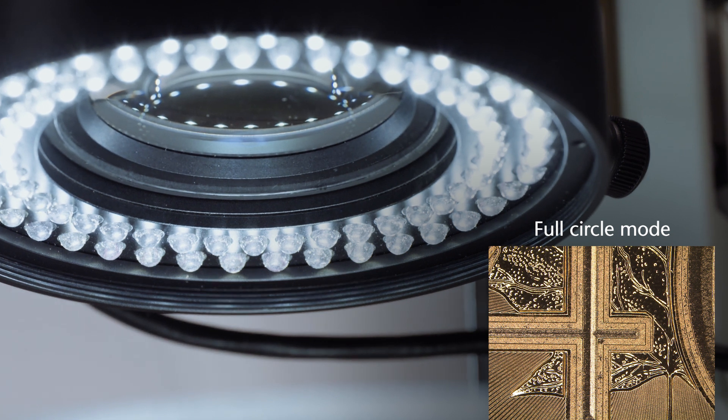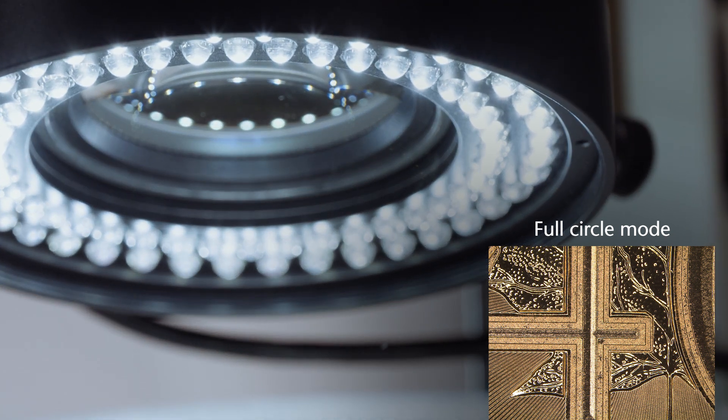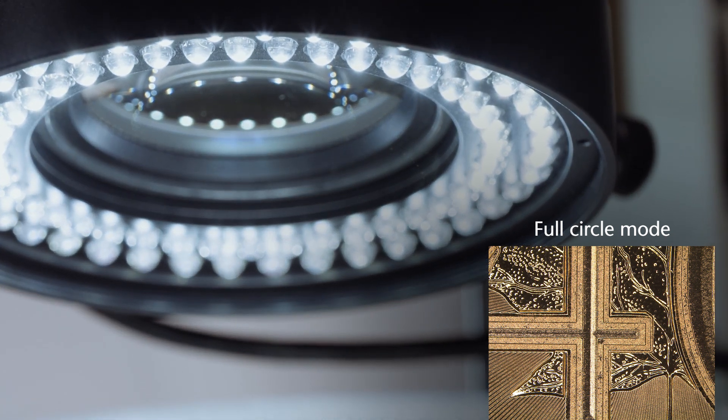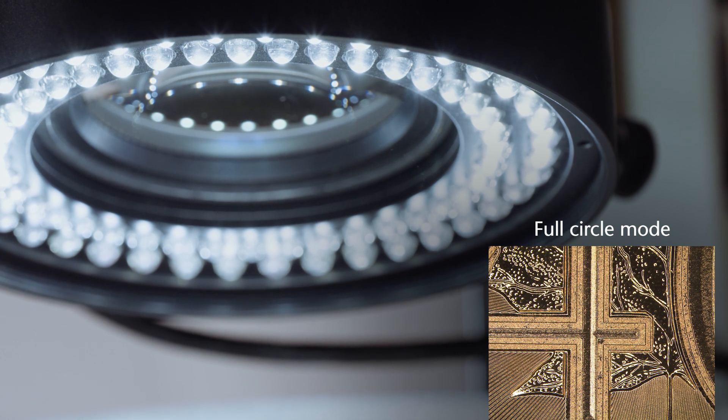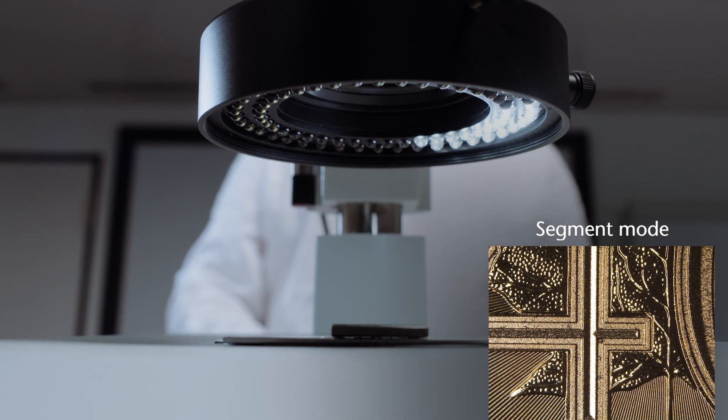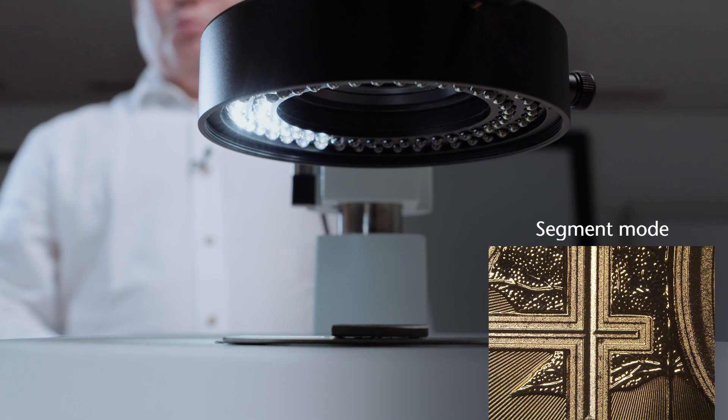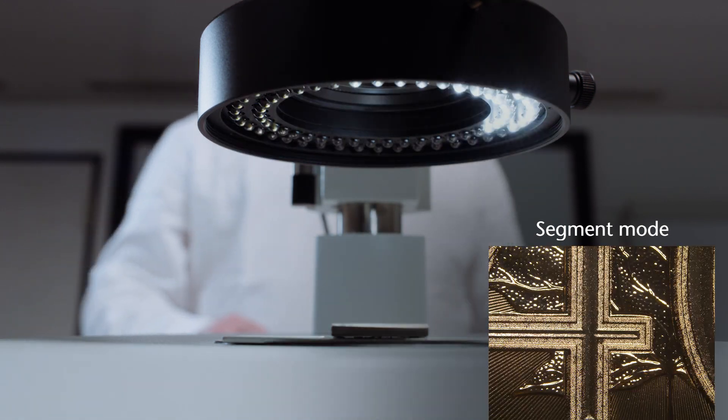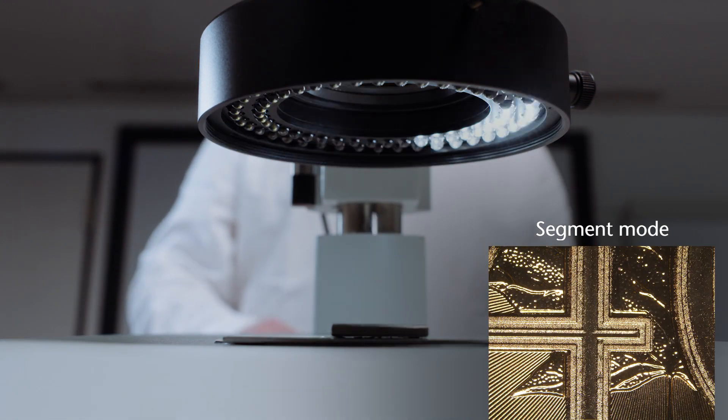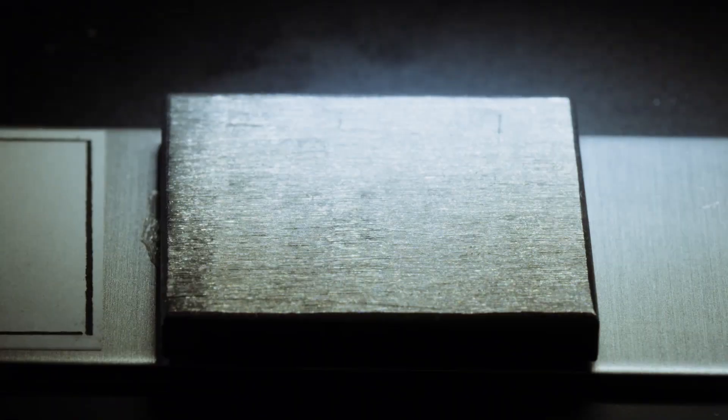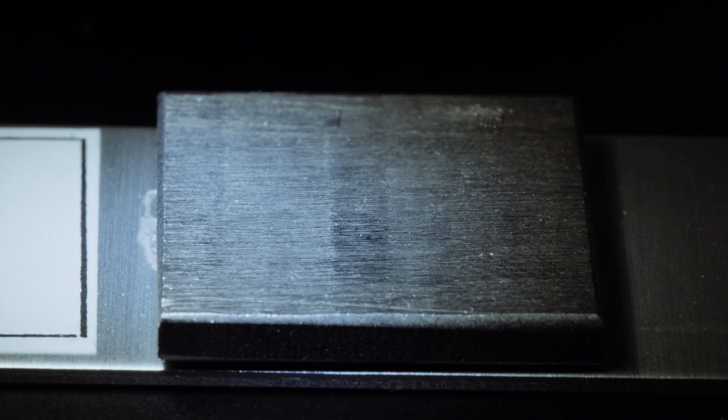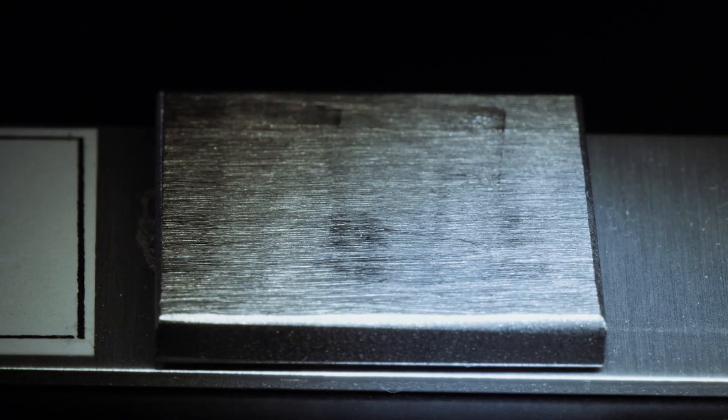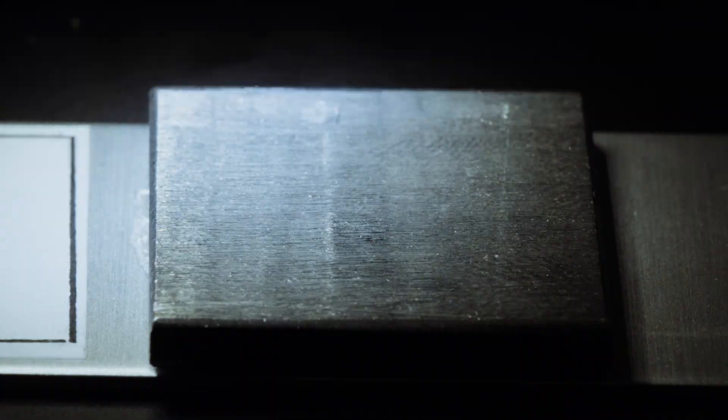In a ring light with normal full circle illumination, the sample is illuminated evenly and shadow free from all sides. In contrast, the sample can be illuminated from different directions using a ring light that uses segment lighting. Shadowing and contrast enhancement, for example, make notches and scratches more visible depending on their orientation.